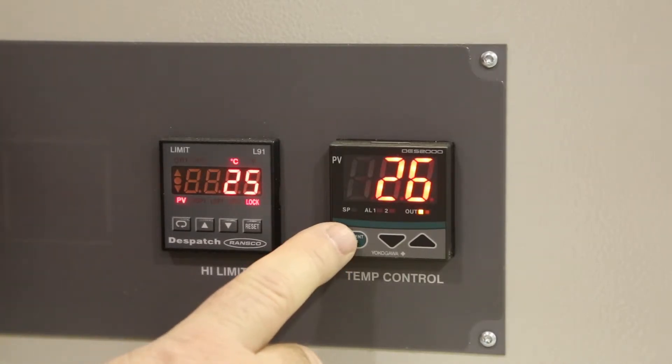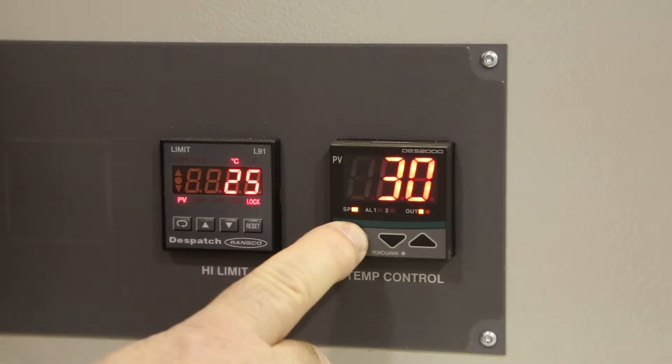First, you need to access the configuration menu by pressing and holding the green button until CTL is displayed.